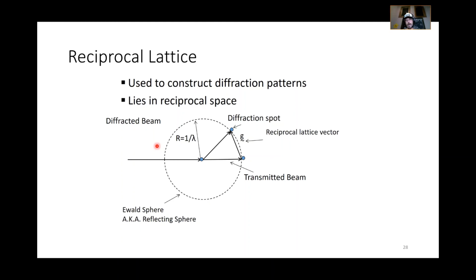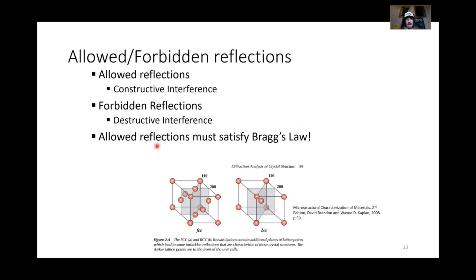I don't talk about it much here because most of what we do in modern X-ray diffractometry is interpreting spectra. For spot methods like single crystal diffraction, what applies to electron diffraction will be greatly applicable to single crystal. So if you're looking for that, just wait till we start talking about TEM. I think I'm going to go ahead and stop now and really just save it for electron diffraction.